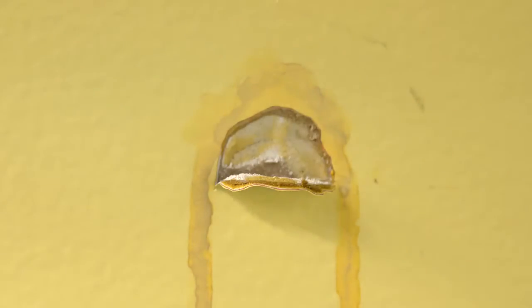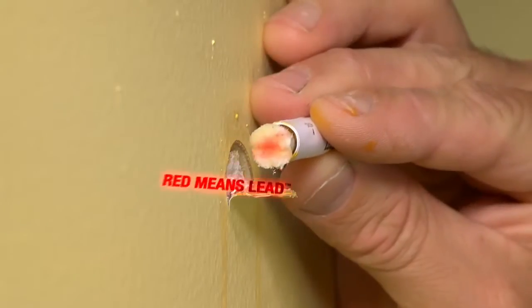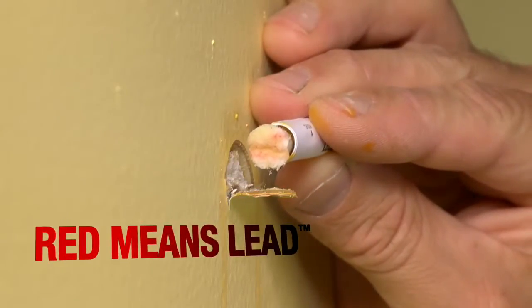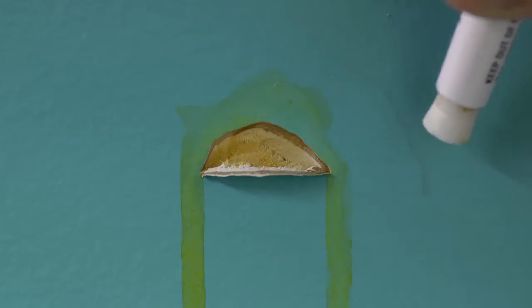If lead is present, a pink or red color will develop along the edges of the cut, flap or swab tip, usually within 30 seconds. Red means lead. If the edges of the cut area and the edges of the flap remain unchanged after 30 seconds, lead has not been detected.